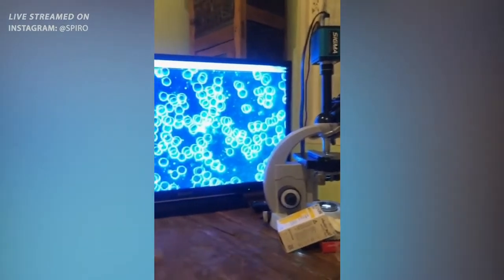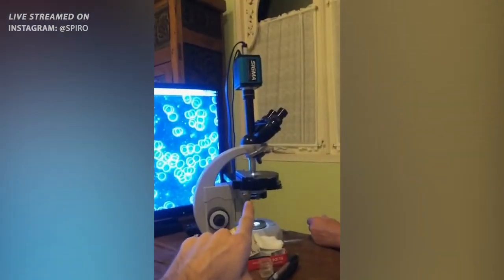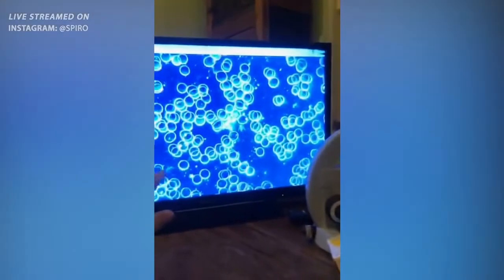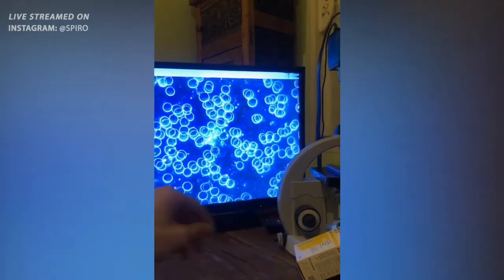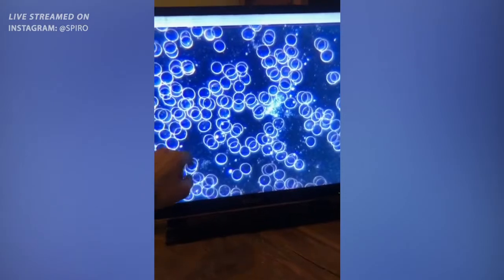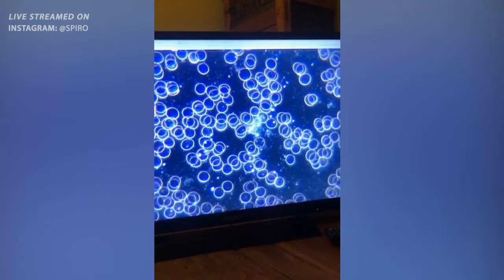Okay. And this is healthy blood, right? So we're testing it live. We're testing Dr. Peggy's blood live. And what we can see is less aggregation. This was tested a while ago, right? This was put under a while ago. And we're seeing the quality of the blood cell intact. So it's not damaged, it's good quality blood cells.